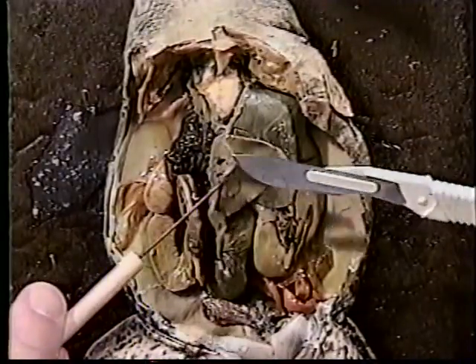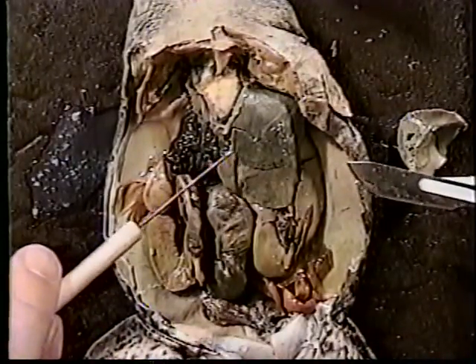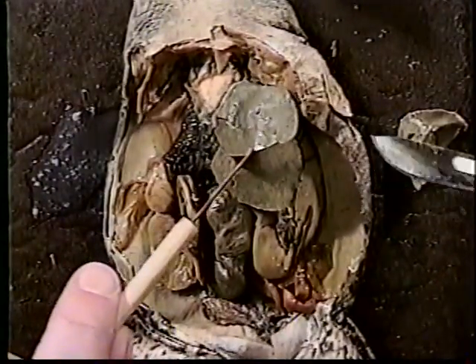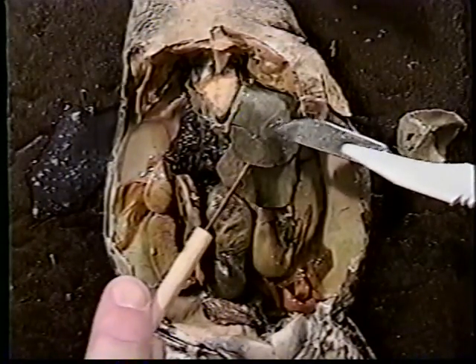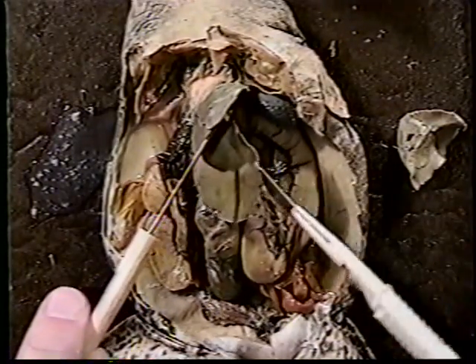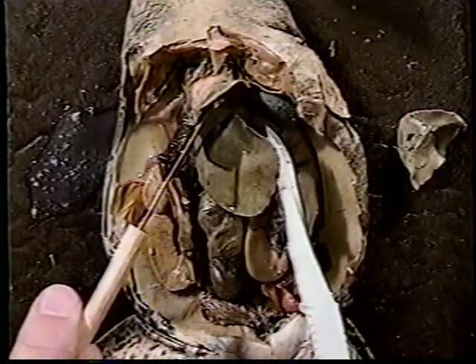Like most organs, the liver retains a lot of water. When removing the livers, it is very important not to damage any other organs that might be nearby, the heart or the lungs, which are located immediately and directly beneath.